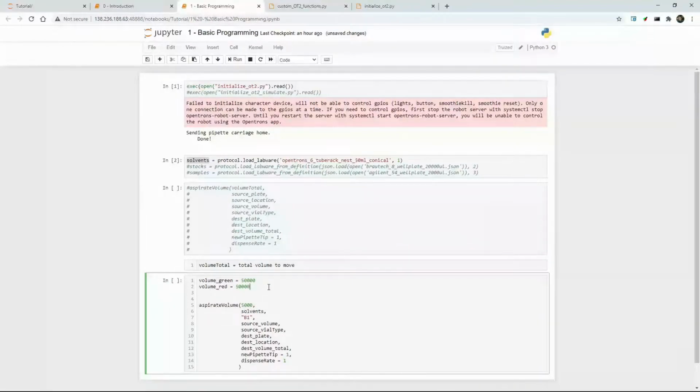Now they are topped off a little bit more. It doesn't matter. We just need to make sure that the actual volume is at least this volume here, because we want to make sure that the pipette tip actually is submerged and we're not sucking up air. And we'll go through how this is calculated again later.